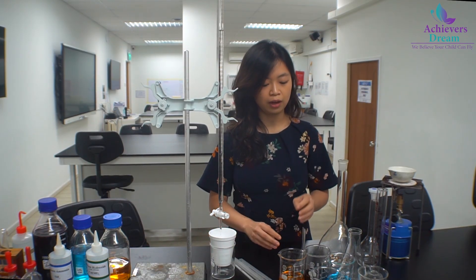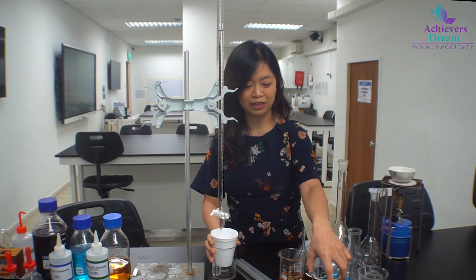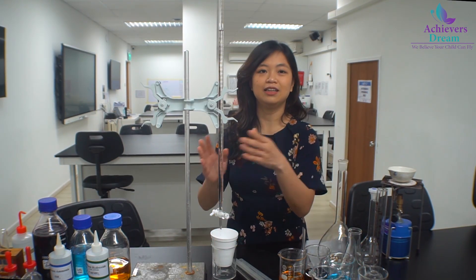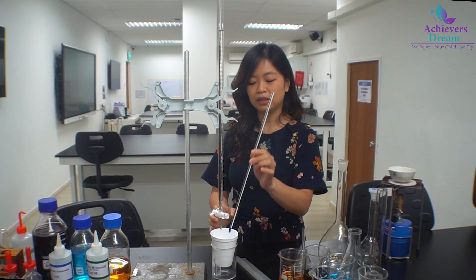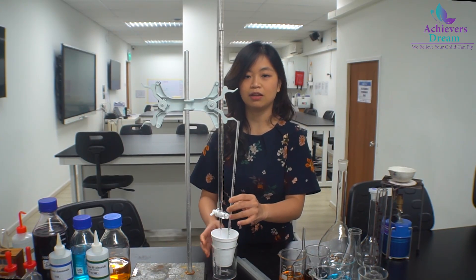We have already filled up the styrofoam cup with the alkali, and the acid is in the burette, which is rinsed and filled up in the usual procedure. We also have a styrofoam cup stabilized with a beaker. Now that we are about to start, we will begin by taking the initial temperature of the alkali in the styrofoam cup.